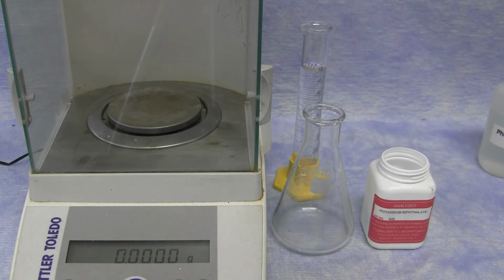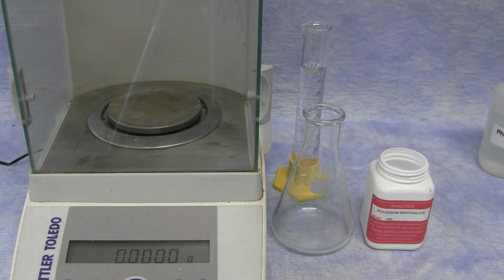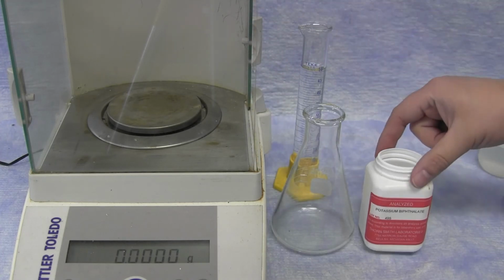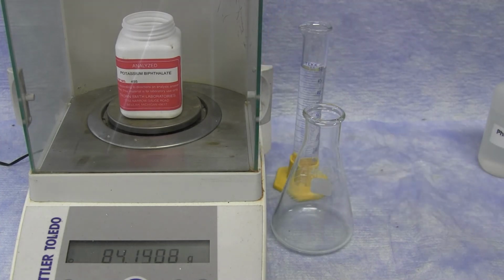In the lab experiment, to measure the equivalent weight, you're going to be given an unknown sample and determine its equivalent weight by titration. You're going to be performing 4 titrations of the same material. As the procedure is written, to measure out the mass of sample used in each trial, you can simply weigh the entire container and obtain the starting mass.